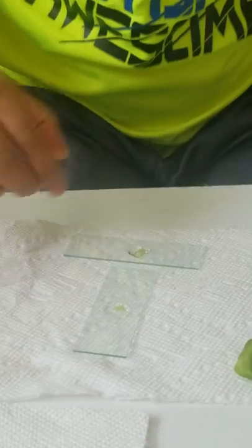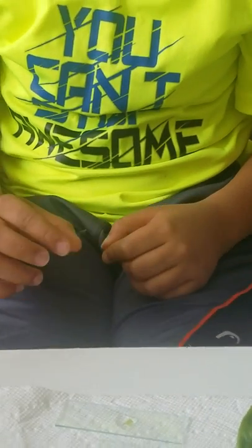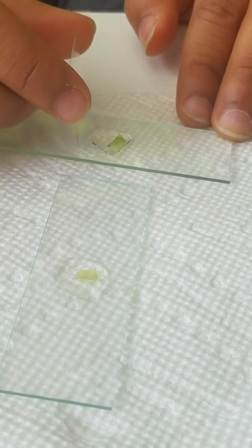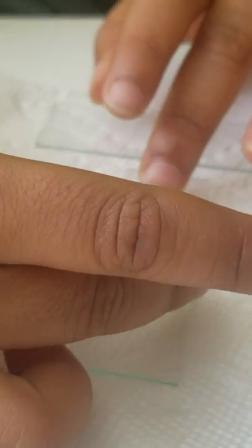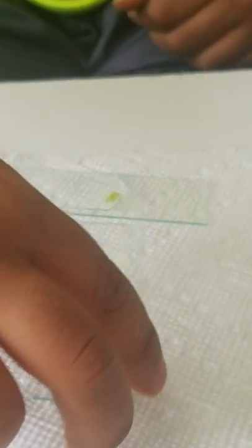After we add the water, we put the slide cover on. Here's a trick to avoid air bubbles: take your slide cover, put it from one corner, then slowly drop it to the other. Like that. You should barely get any air bubbles, though you'll still obviously have a few. After doing that with both slides, it's time to take them to the microscope.